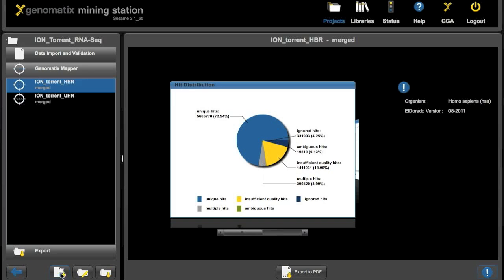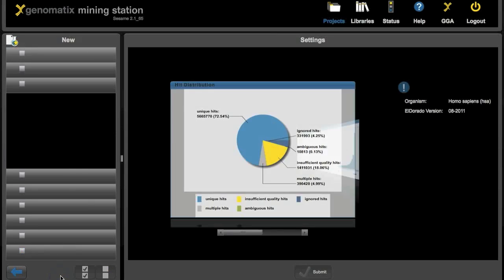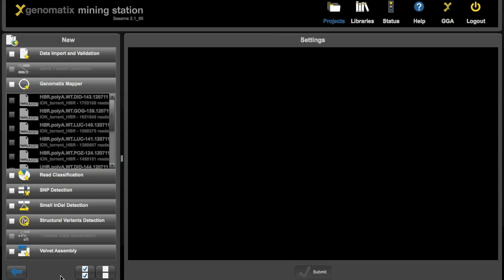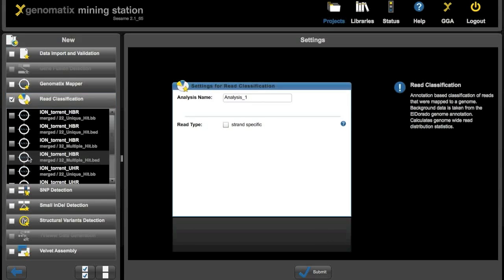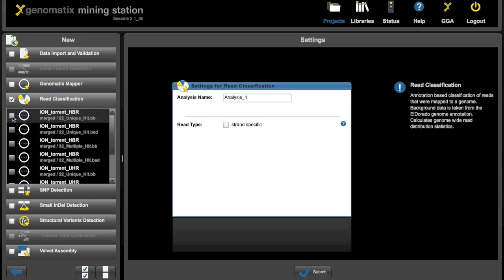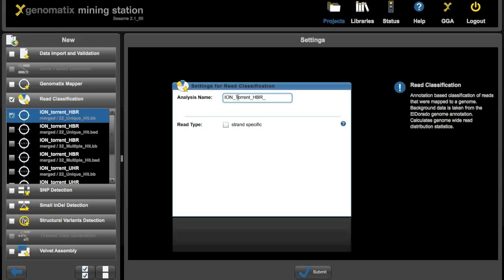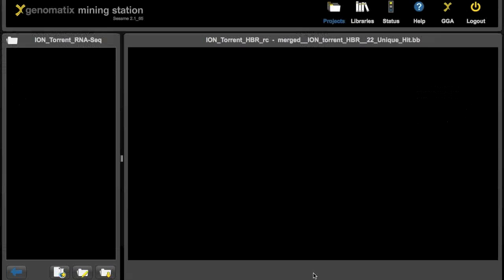And what we will do now is we will do a classification of the reads that got mapped. So we start a new analysis, click on the read classification analysis type, and select the uniquely mapped reads from the human brain reference. And submit this analysis.